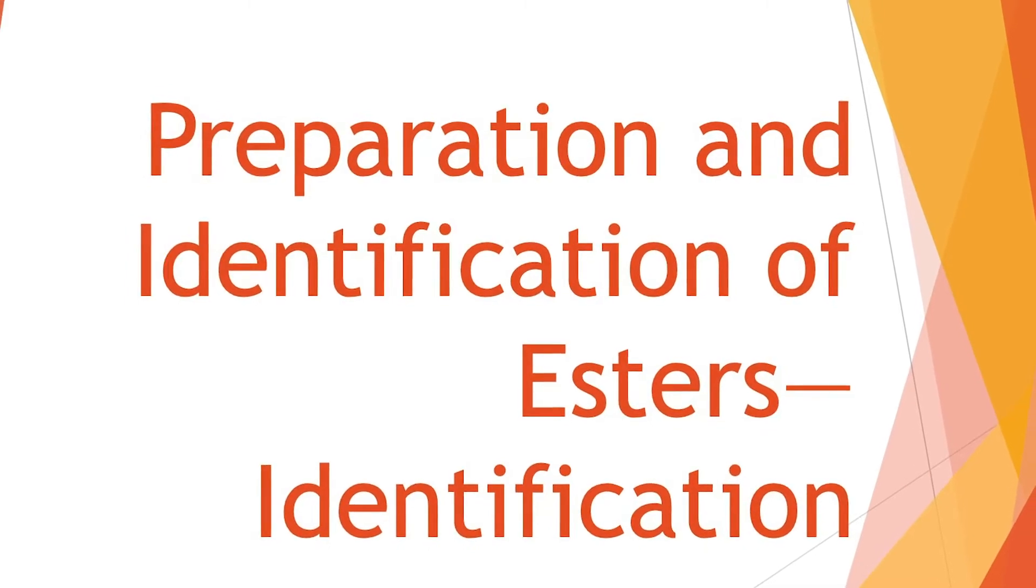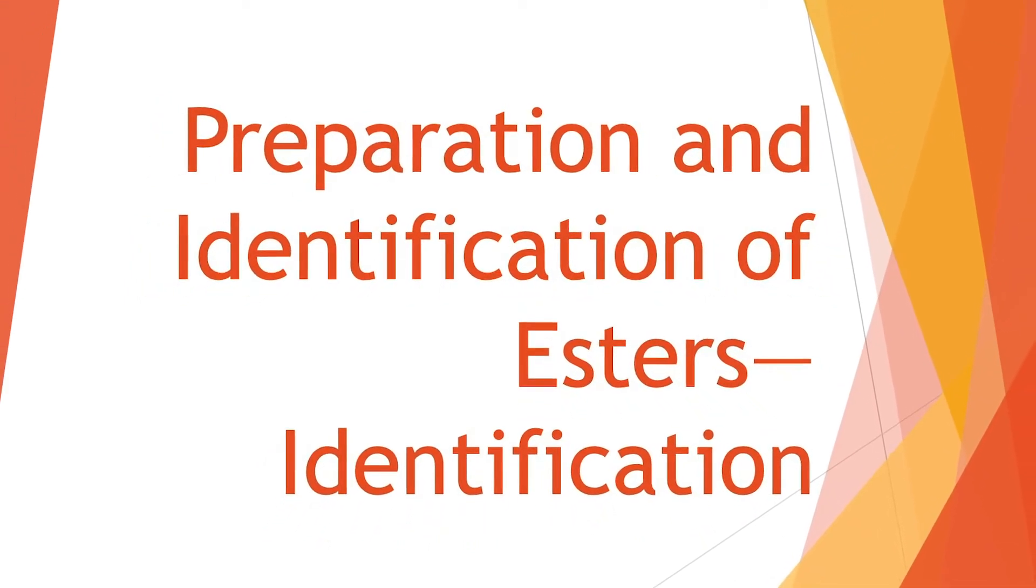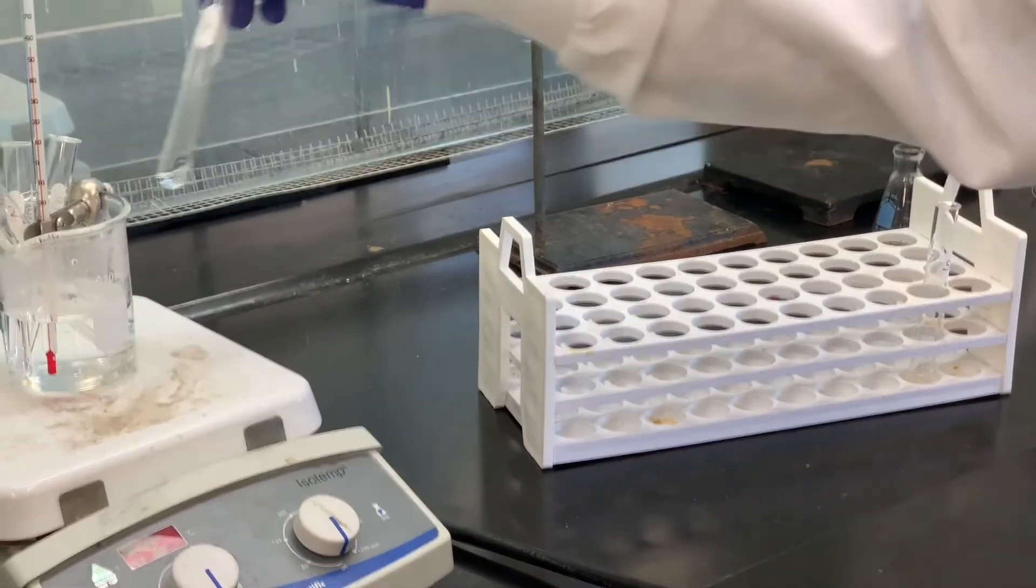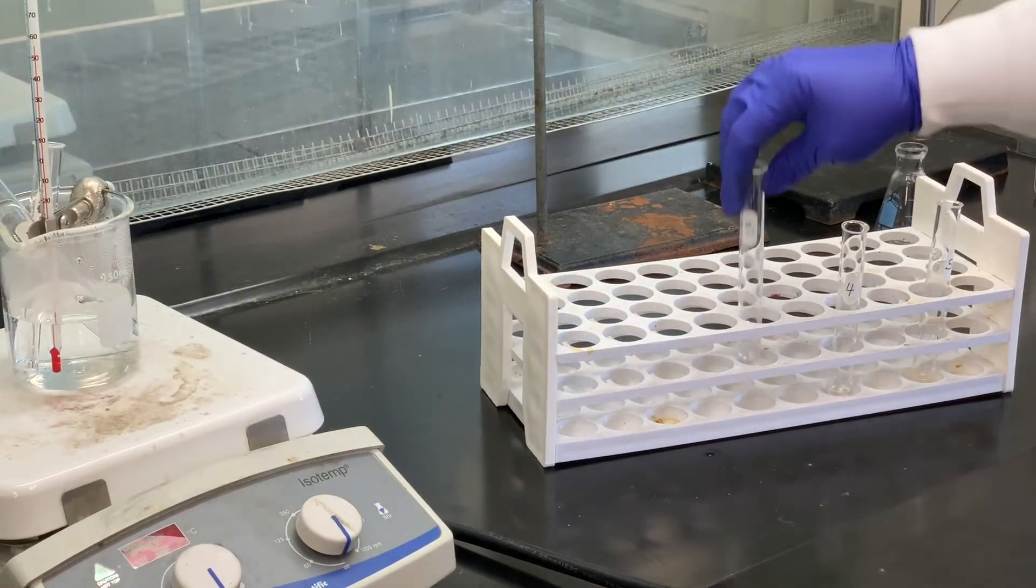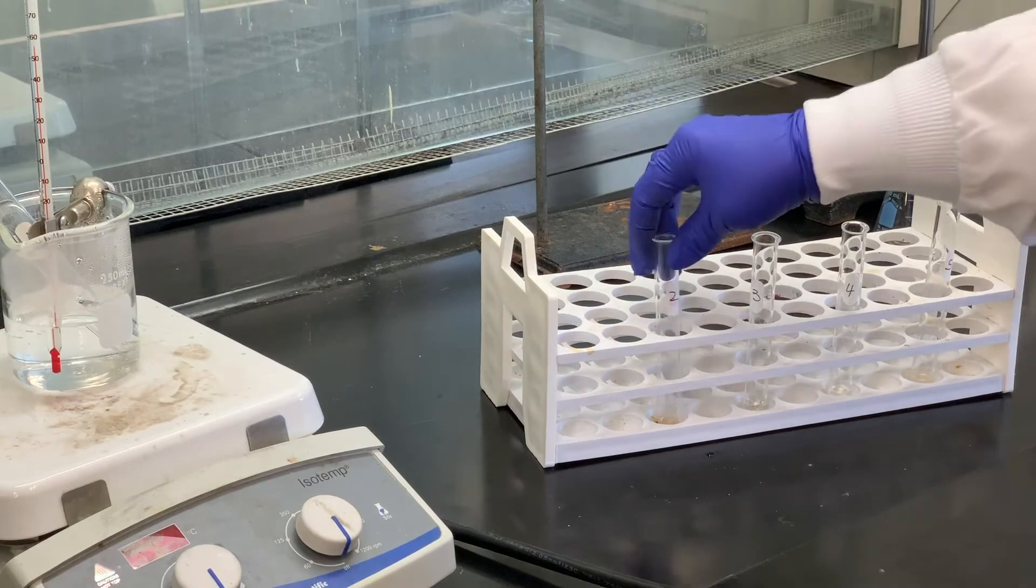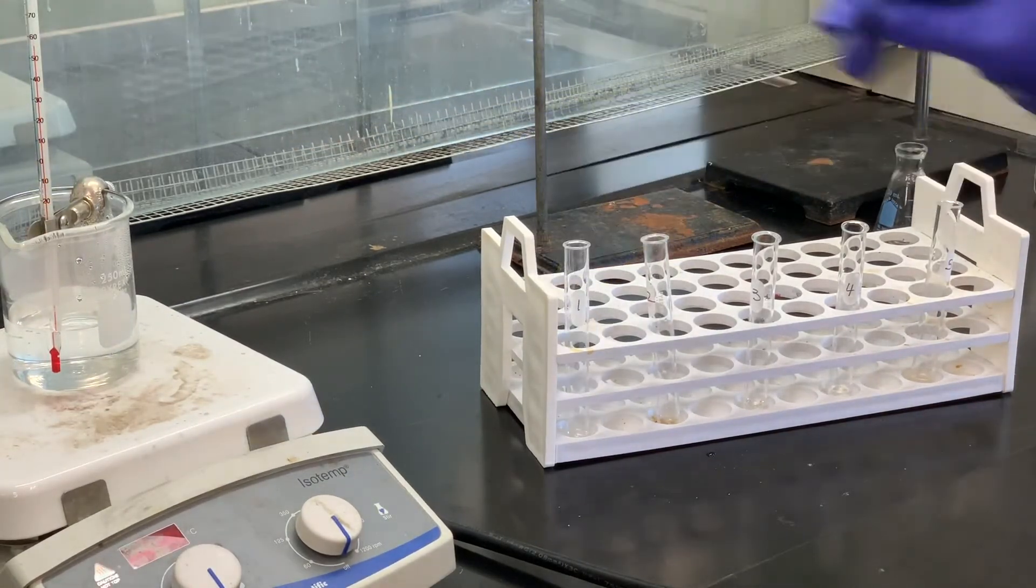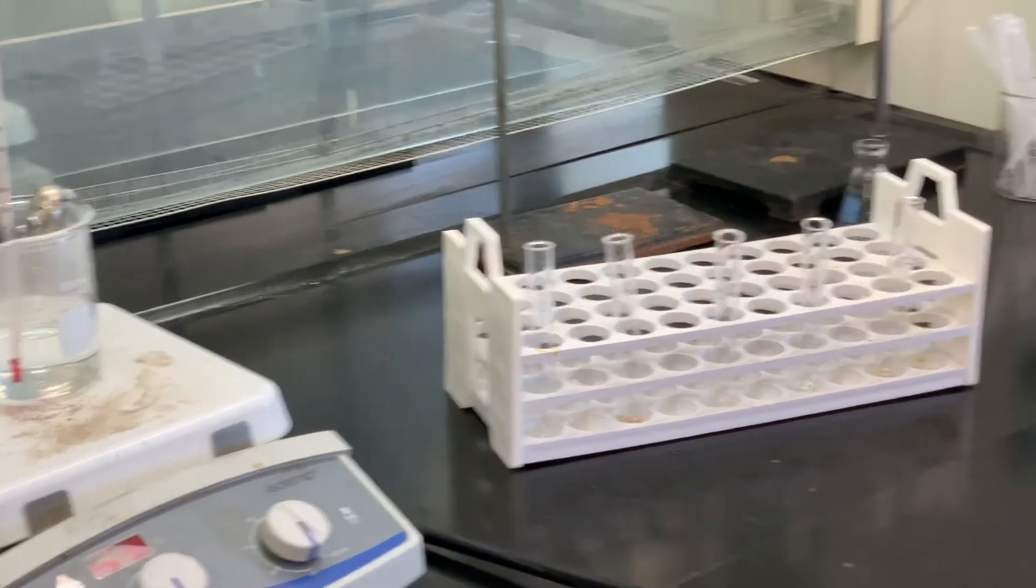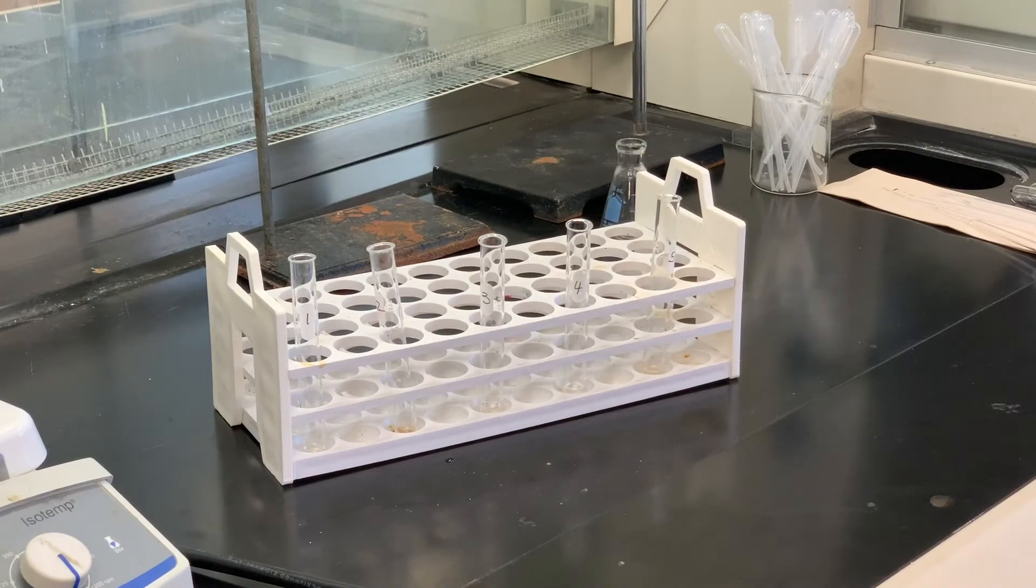It's been 10 minutes at around that 60, 65 degree range. So what we're going to do now is just take these test tubes out and let them sit, just cool for a couple minutes. And then we'll go back and we'll add some water to this. We should get two layers to form. And then what I'd like to do is we'll isolate the organic layer, which should be on the top for the esters. And then we will take a note of what the odor is that we smell coming from those esters.